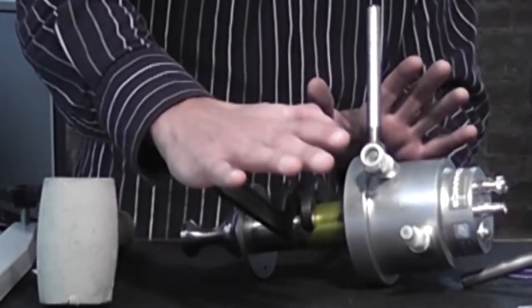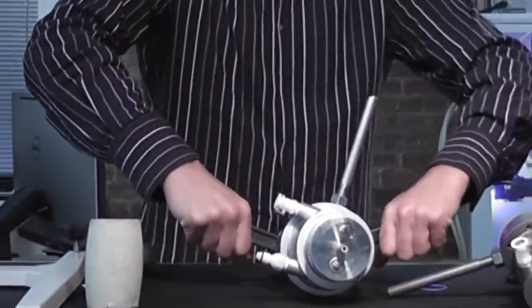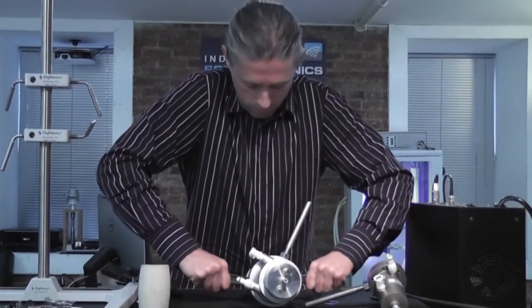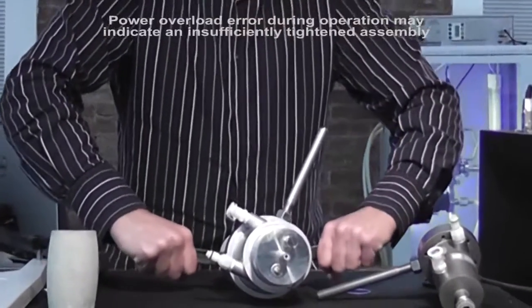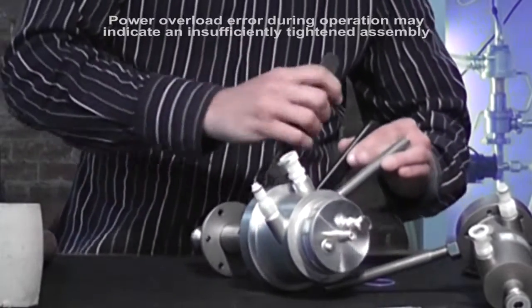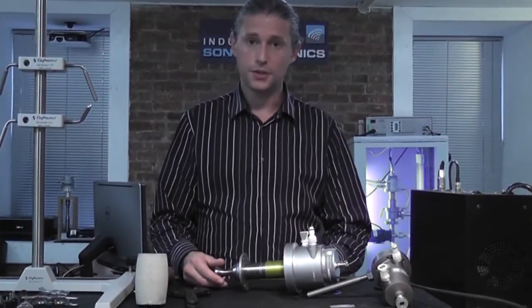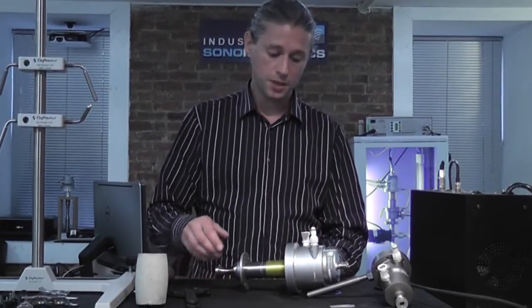Once you have the spanner wrenches positioned in this way, push down by hand. At this point, the horn and the transducer have been assembled.